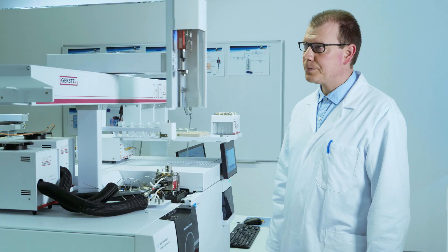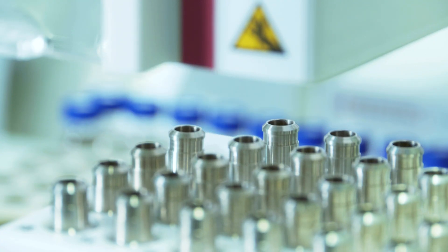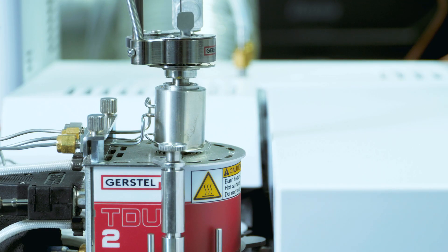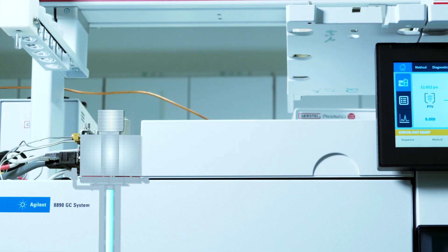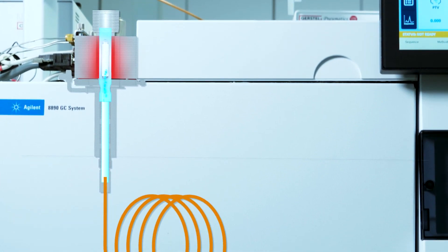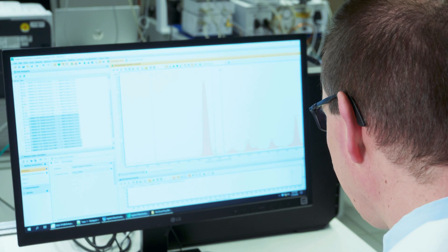The rest is fully automated. The MPS Auto Sampler processes sample after sample, delivering the tubes to the Thermal Desorption Unit, or TDU. Using temperature-programmed thermal desorption, the analytes are transferred to the analysis system where they are focused on the Gerstel Cooled Injection System, or CIS inlet. From the CIS, they are transferred to the GC column, producing a single combined and comprehensive chromatogram for organic contaminants in water with suspended particles.